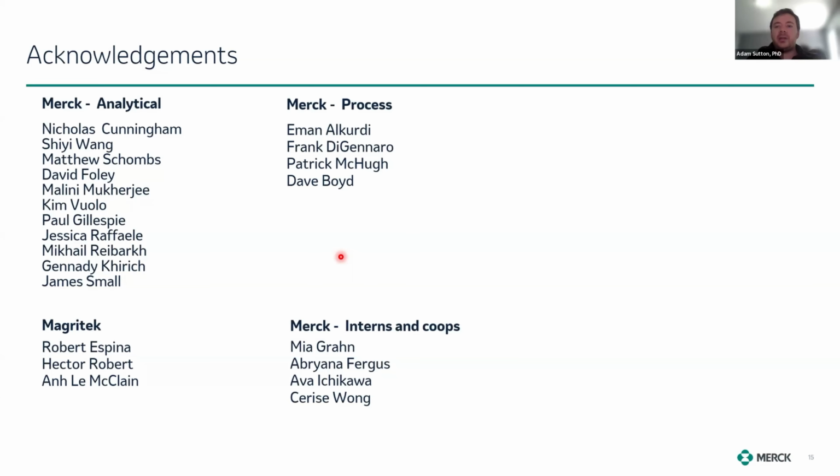Sure. So we do know that other companies will use benchtop NMR in GMP spaces. We're just beginning to do that now. So it is completely possible. But for a lot of our work, we don't have to be in a GMP environment. In these situations that I'm giving, we're just enabling people who are making the vaccine, at a specific point of the vaccine, to respond to how they're making it and better optimize that process. And in that process optimization step, you don't really need to do things under GMP conditions. If we were making this in a manufacturing space where you needed to know exactly when to stop the reaction, then it would be in a GMP space, and we're working towards having those kind of things implemented. But at the moment, that's not necessary.